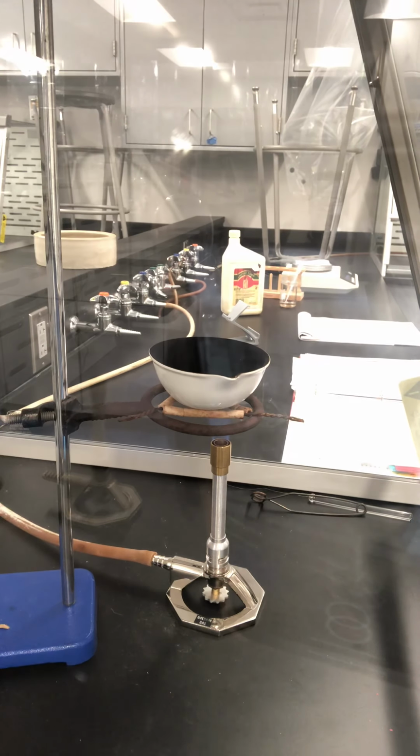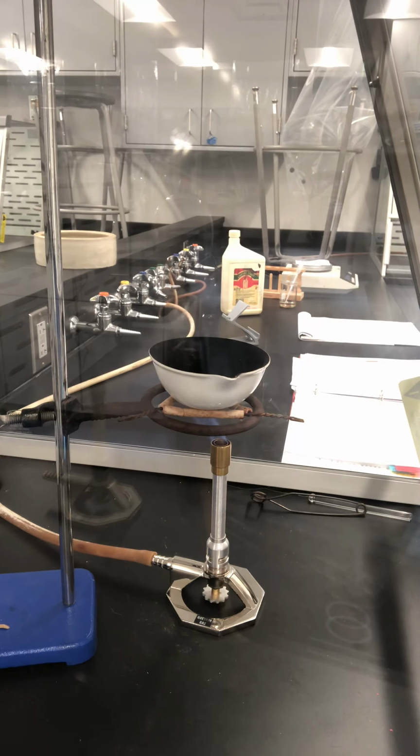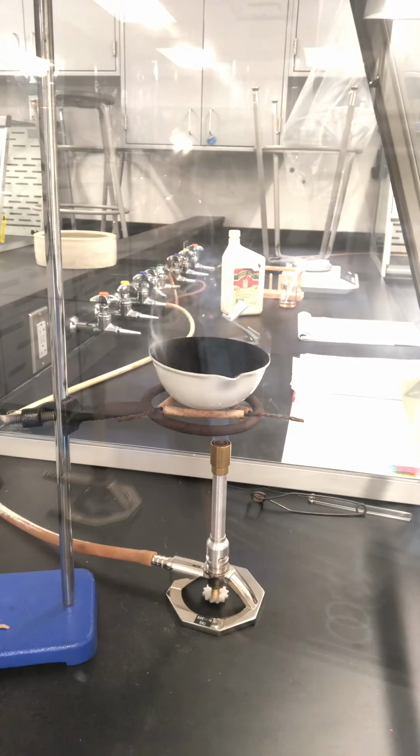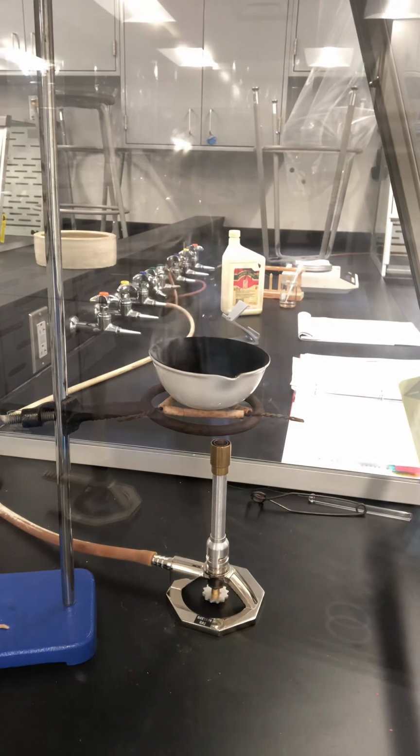And I'll give you some background. Even with low sulfur content in the oil, there will still be some sulfur. And when you burn the oil, carbon becomes carbon dioxide. Sulfur is going to turn to sulfur dioxide or sulfur trioxide.